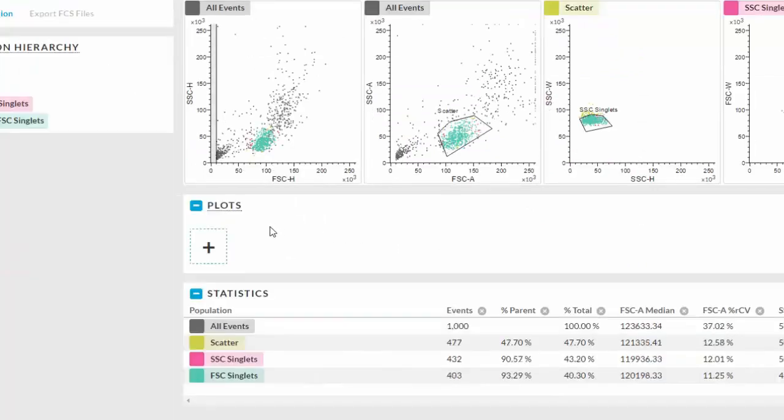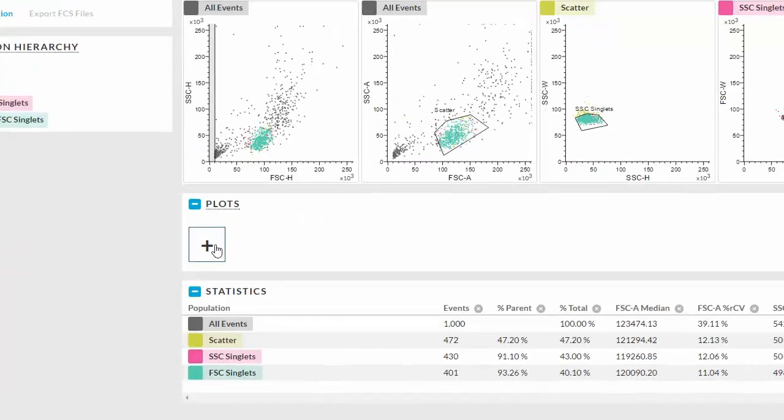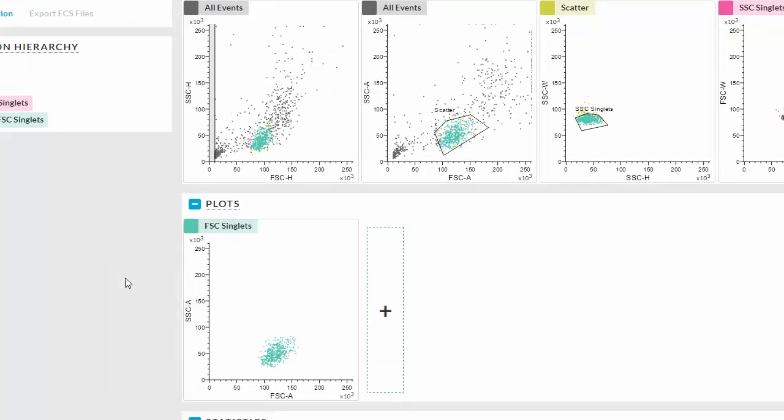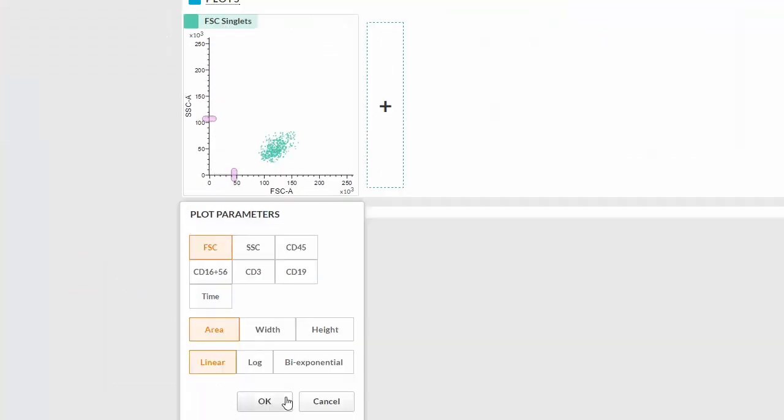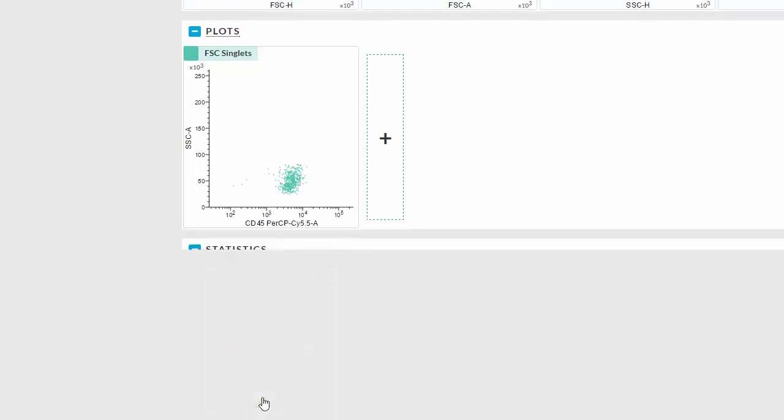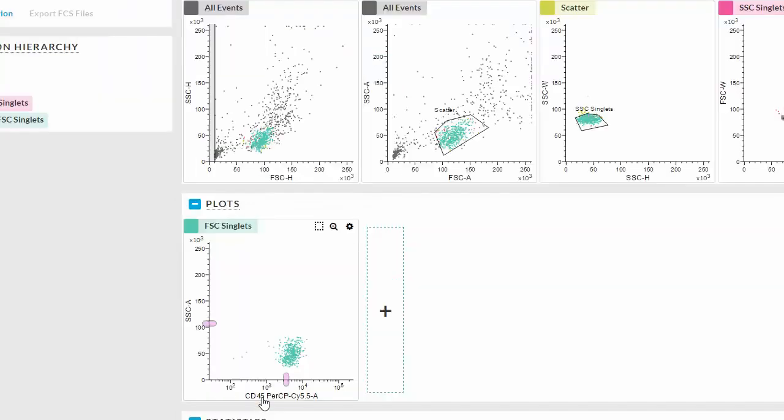To add a plot, click the plus sign and choose the plot type. Hover the cursor over the plot to choose the plot's parameters. Make sure you click OK.